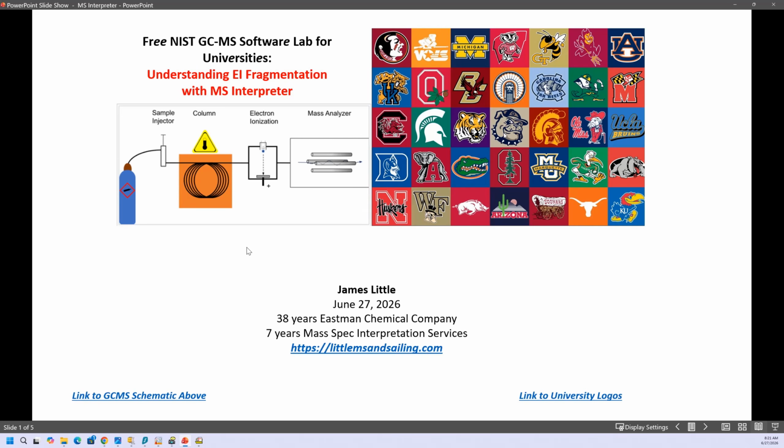This video concerns understanding EI fragmentation with MS Interpreter, and it is part of my free NIST GCMS software lab for universities. It includes both a video and a handout, and you really should look at both of them to totally understand the topic.